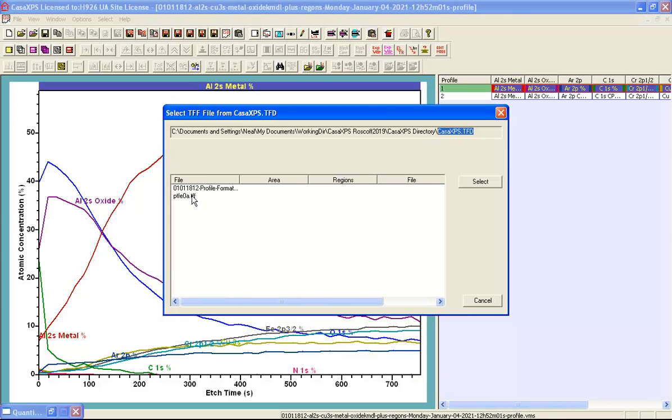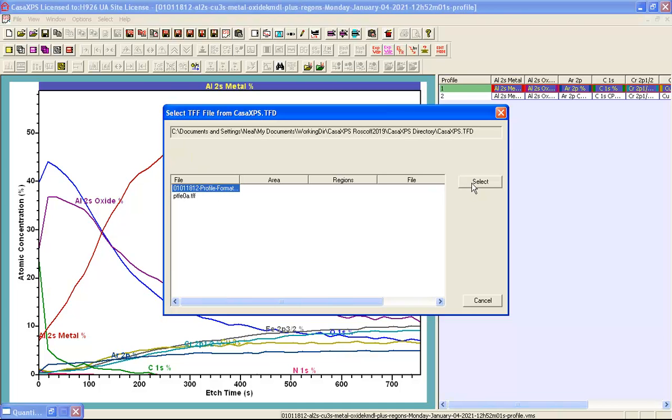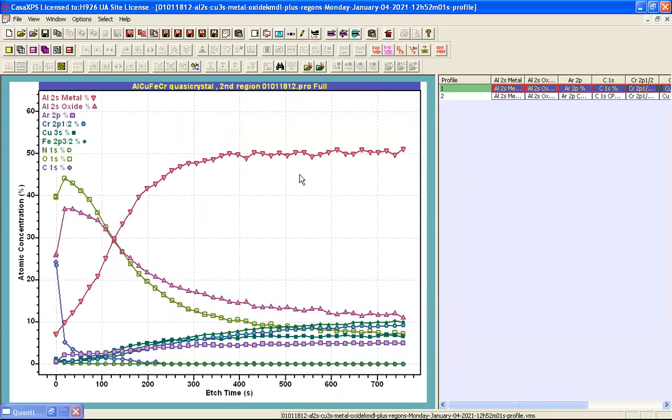In this case I have previously created a TFF file that is appropriate for these types of profiles. So when I select this TFF file and say select then the display state is adjusted and takes on the form of the TFF file that was previously saved.